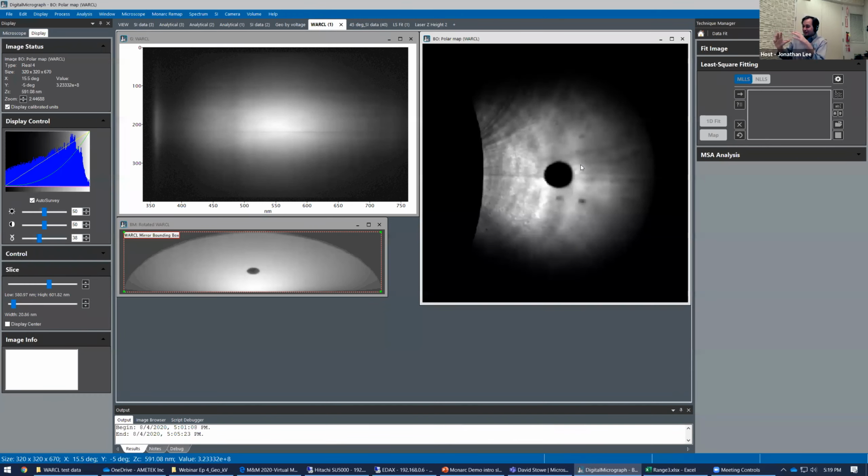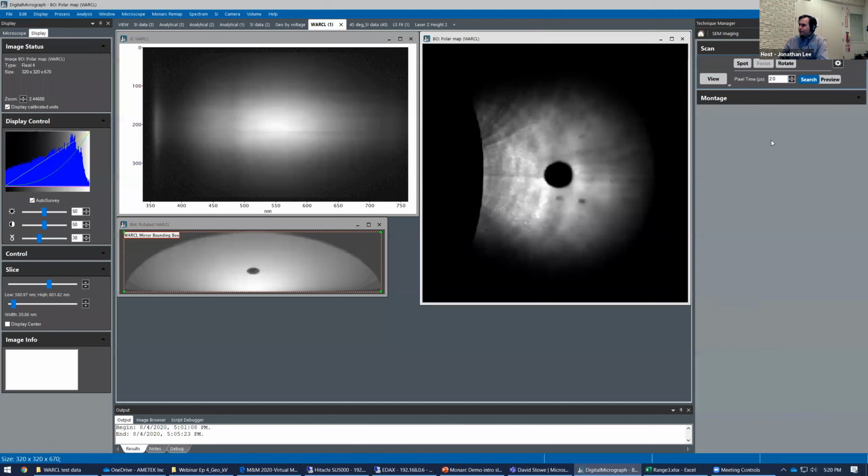What it does is it would take an image, but in this case it wouldn't be a spectrum image. It would be some two-dimensional image. It could be unfiltered, or you could pass it through a filter. We have several optical filters built into the system. You could do polarization filtering, and then you can step the stage 80% of the image size so that there's overlap, and then take another image and you just serialize stage movements. That's called montage. It's right here. In this case, I had it set up to do a 10 by 13 with 20% image overlap between successive images.